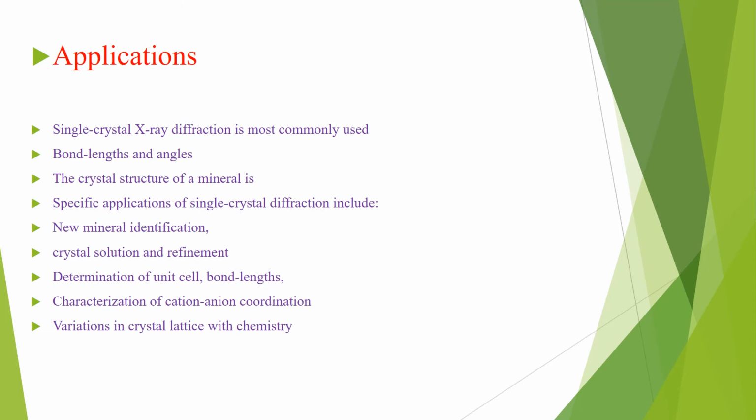And the characterization of the cation and anion coordination is also one of the applications of single crystal X-ray diffraction. And the variation in crystal lattice with chemistry is also studied by using SCXRD, Single Crystal X-ray Diffraction technique.